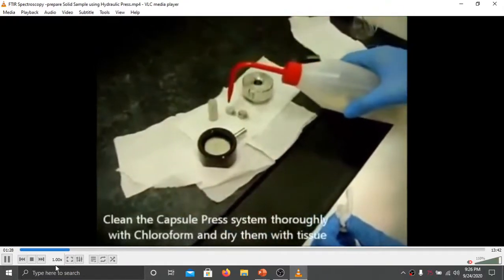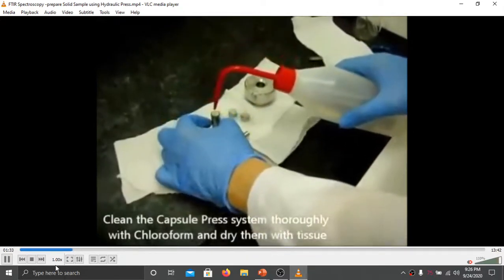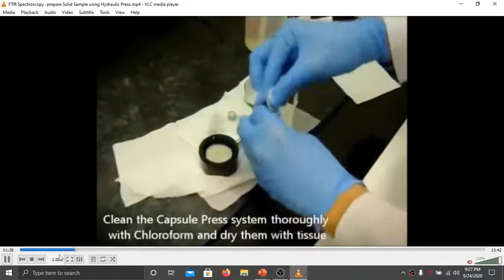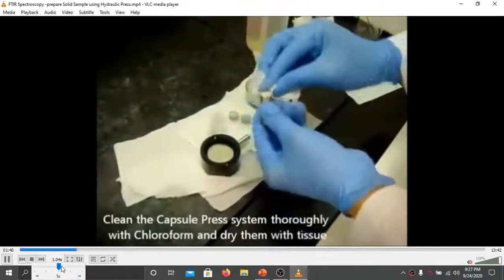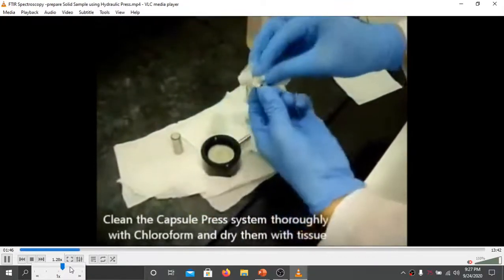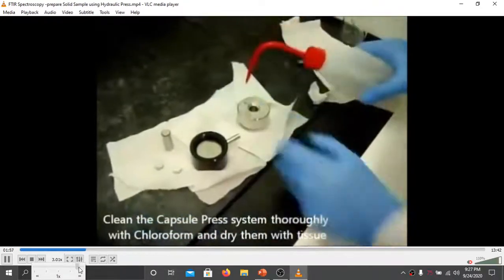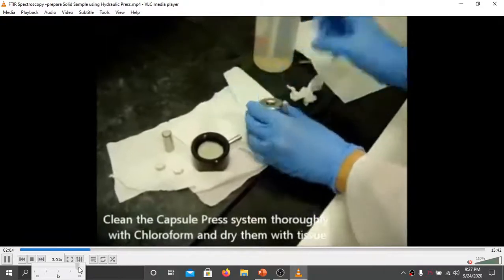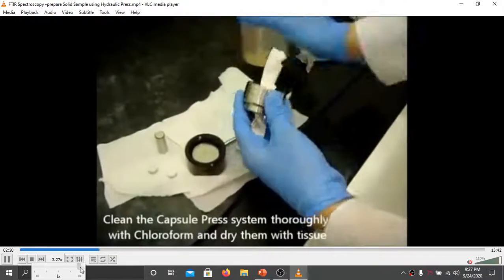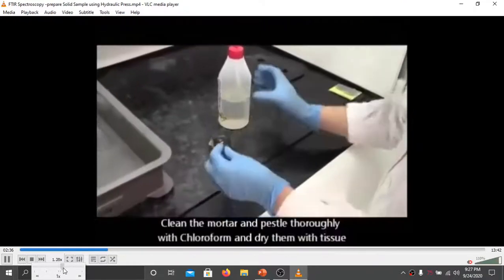Then they are wiped with tissue paper so that they are completely free from adhered material and very clean for operations. So this is the cleaning of the surfaces. This is done with tissue paper, and care is taken that there is no residue adhering onto the surfaces. All die parts are also cleaned thoroughly. Then it is dried with tissue paper so that no chloroform is retained on the surface.